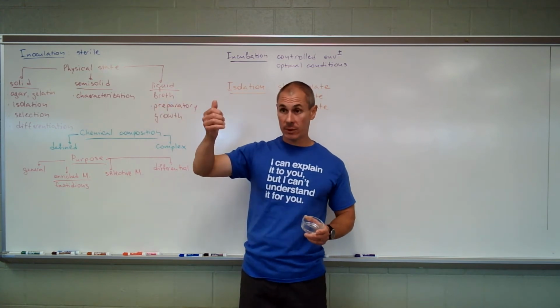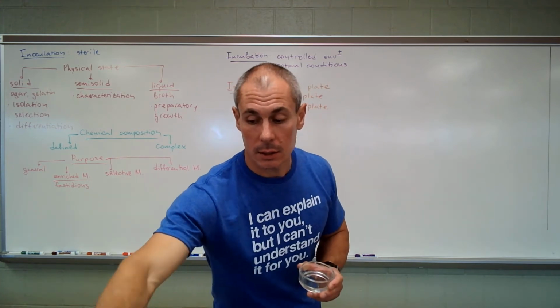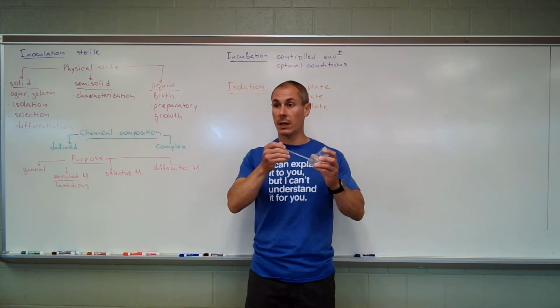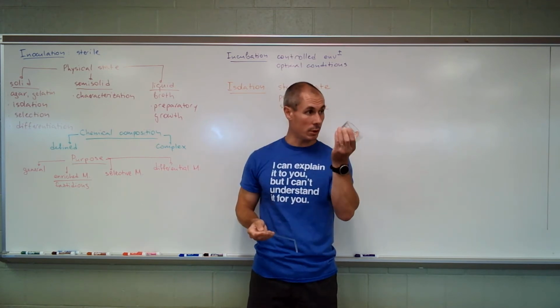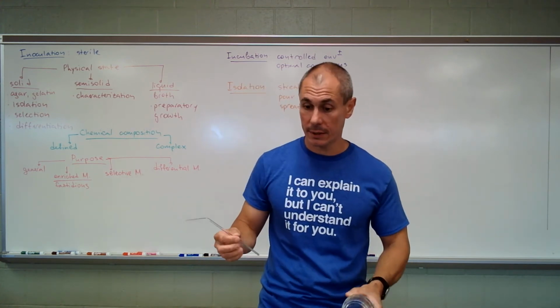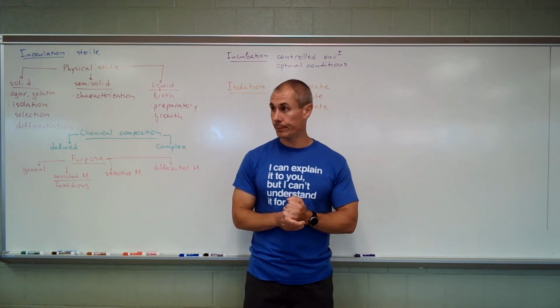With a spread plate, you make serial dilutions not by the agar, but by broth. What you do afterwards, you take a sample of dilution, add it to the plate, and then using a fancy device named hockey stick, distribute the solution on the surface. Okay? Same idea, slightly different technique. So again, match the description with the term, right?